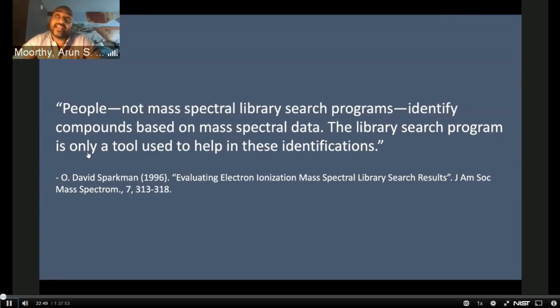We have many more tools, and they're much more powerful. But at the end of the day, it's still people that have to make these identifications and make these calls. And so that's why this workshop is actually not really about the tools. I've shown you all the tools, and you can always find literature about the tools. But what we're excited to share with you are some people using these tools, and not just any people, but experts in the field that have used these tools, among other tools, for years. And so with that, I'm going to pass it on to Ed to introduce our star-studded lineup.